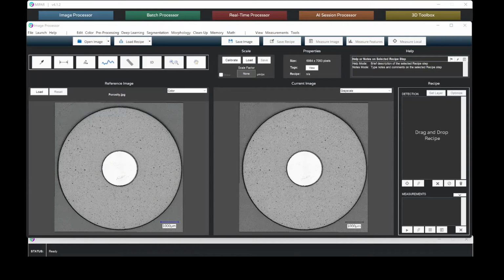When performing characterization of porosity in ceramic parts, micro-CT imaging is a fast way of collecting valuable information. This analysis can be extremely useful in defect analysis and quality assurance. In this particular application, the operator was interested to quantify the number of pores and the pores above a certain area. In addition, measurements such as area of the largest 1,000 pores were also of interest.